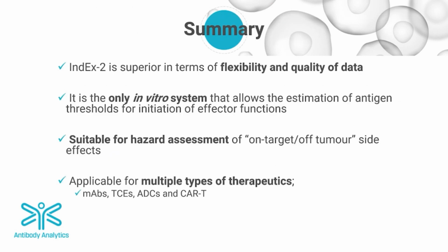So in summary, the IndEx-2 system is an in vitro system that allows the estimation of antigen thresholds for the initiation of effector functions. I hope I have convinced you that it is useful for assessing on-target off-tumor side effects, and that it is also applicable for multiple types of therapeutics, including monoclonal antibodies, T-cell engagers, ADCs, and CAR-Ts.